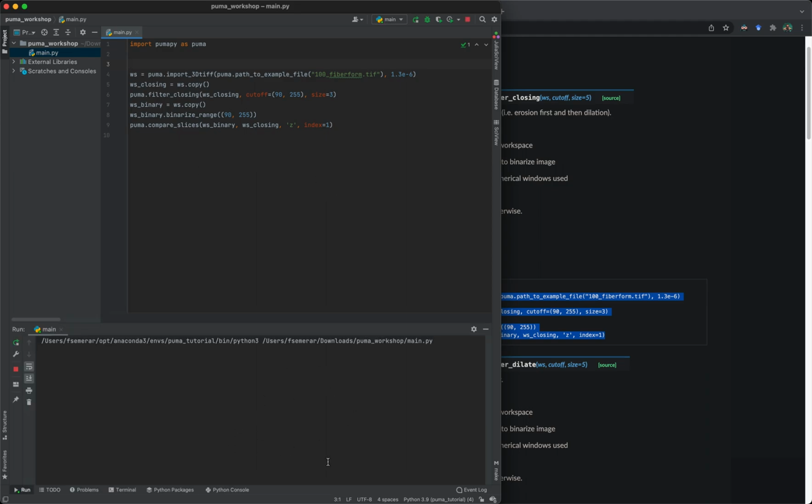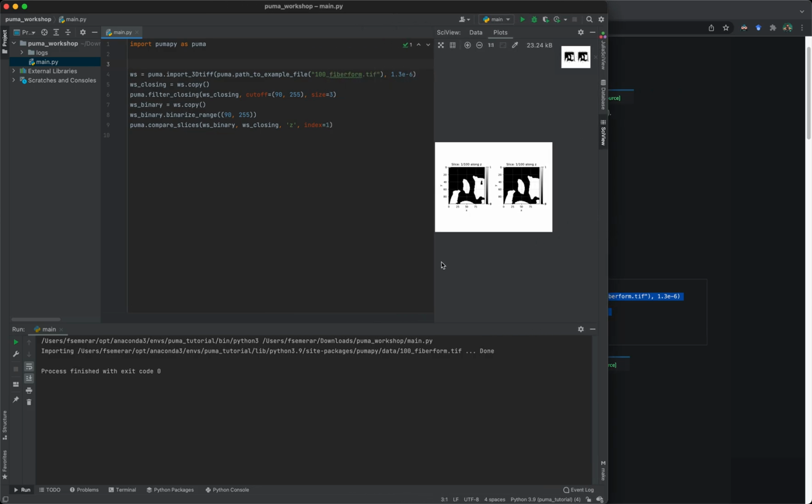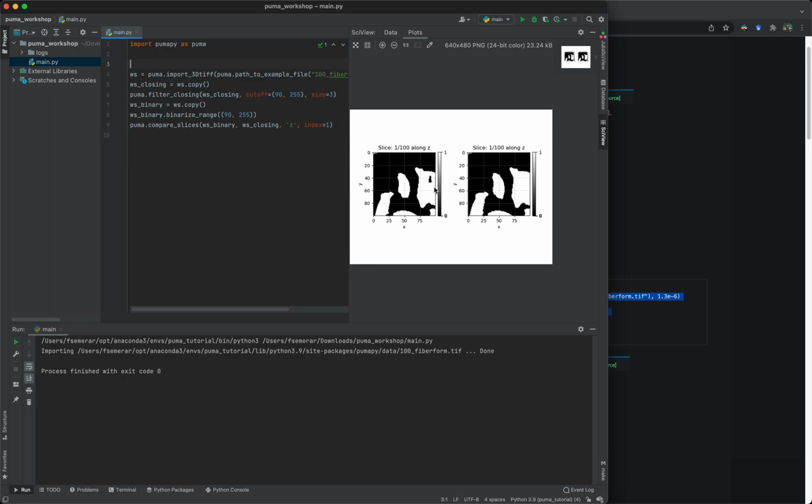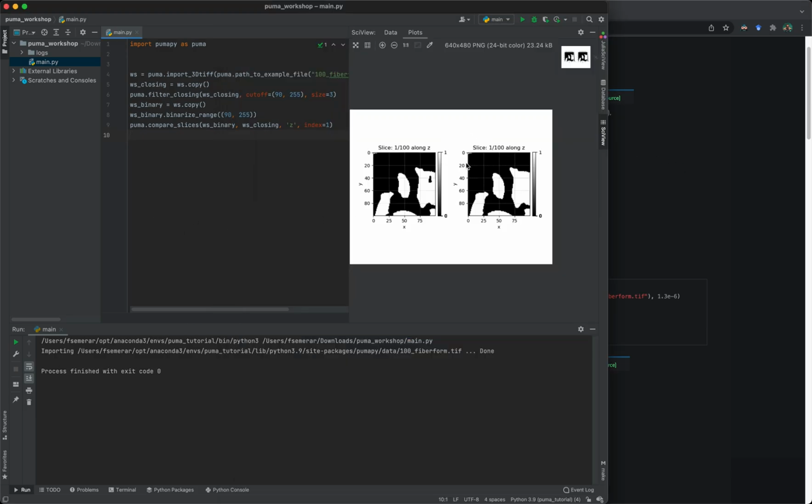At this point, the project is probably still linking against the Conda environment, but as you can see here, the first time it has just run a very simple example data that we have inside PuMA, and then it has imported it, and it has just applied some filtering, which was just the example that I grabbed at random.